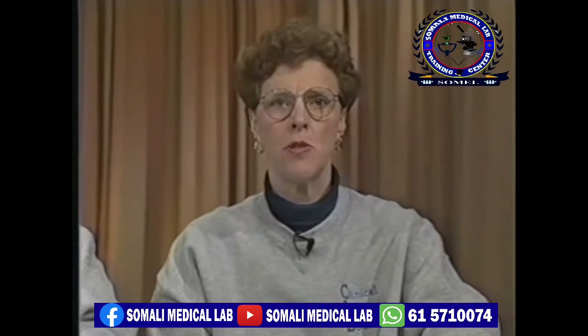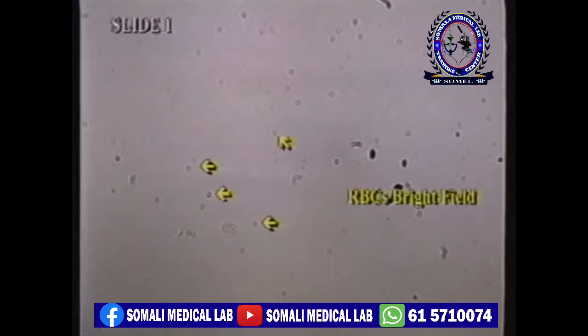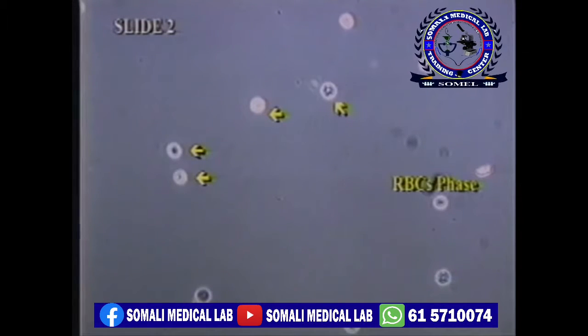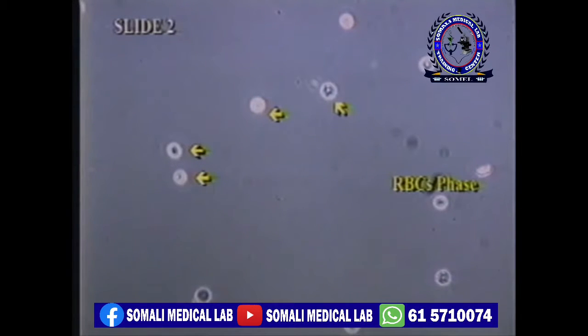The first structures we will look at are red blood cells. In this slide, we see many red blood cells using routine light microscopy. In this slide, we see many red blood cells under phase microscopy. You certainly can see the advantage of using a phase microscope. The elements are much more obvious.